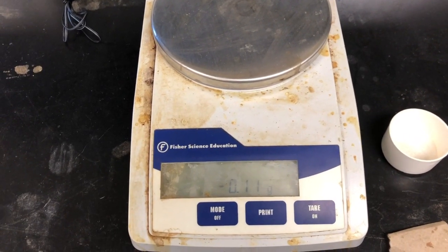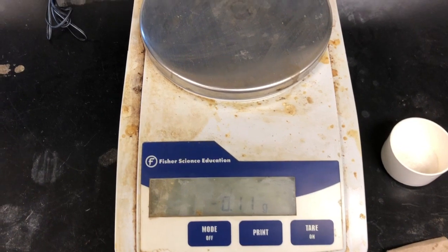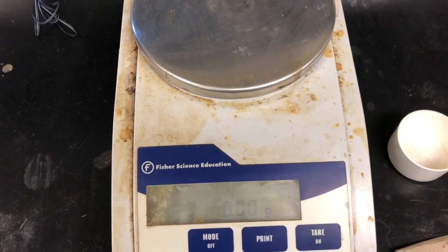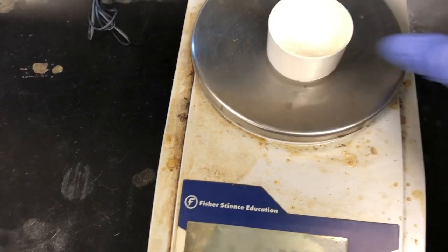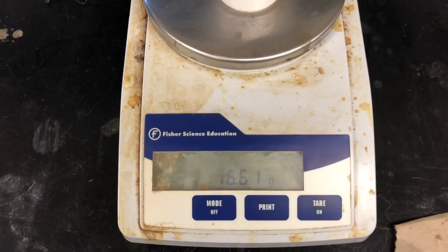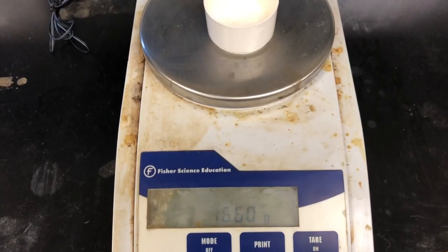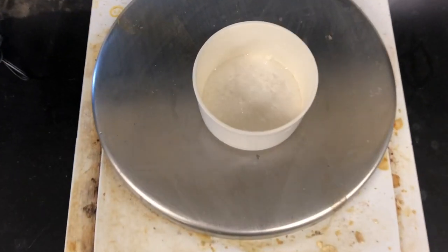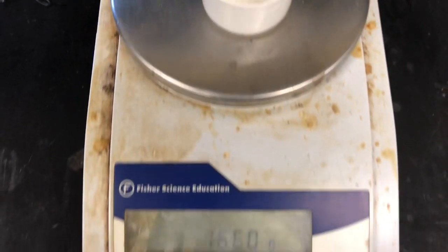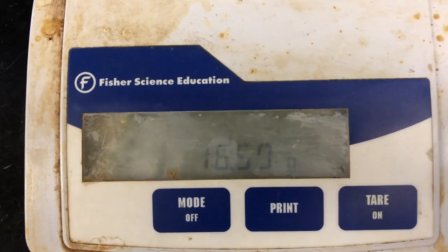So now that we're ready to weigh the dried recrystallized product, you want to make sure you tare the balance so it's at zero, and we are going to place it right here and record the mass. So we're exactly at 16.60. Here's our recrystallized product, and again, here is the mass.